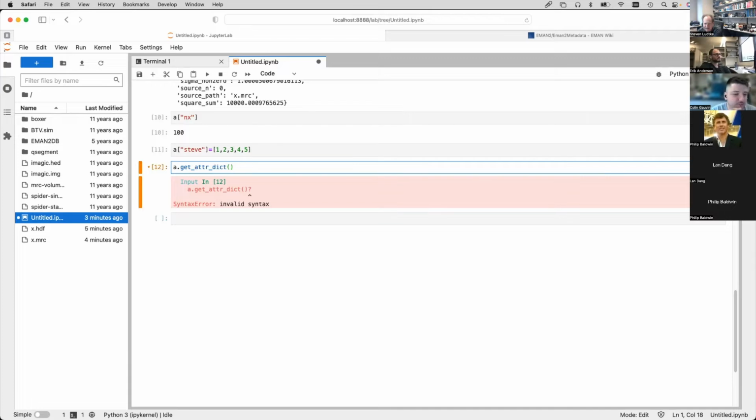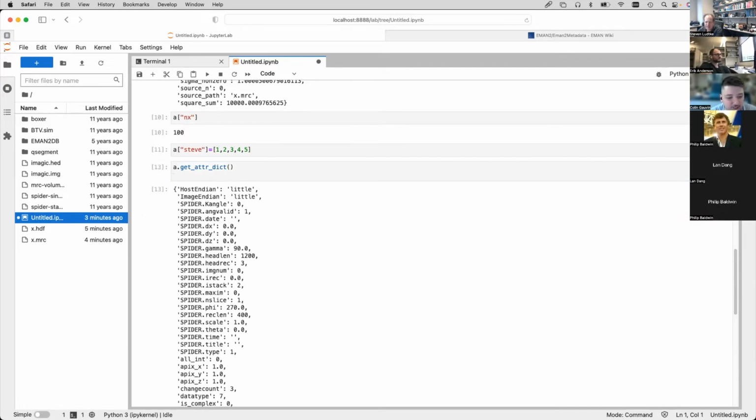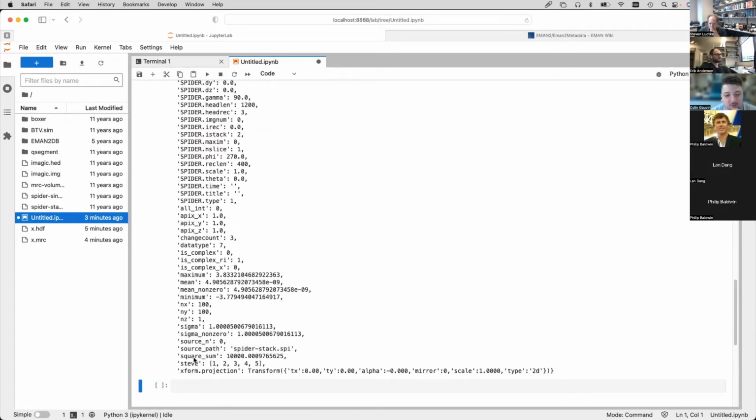The reason why I'm asking is because I have MRC files that I'm trying to feed into some old Uppsala Software Factory programs, and they crash. I've found that opening and saving the MRC file with Coot gets it so that it can read it. I'm thinking I could probably figure out a way to sanitize it with EMAN first.